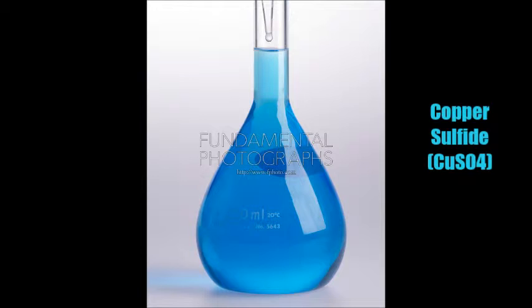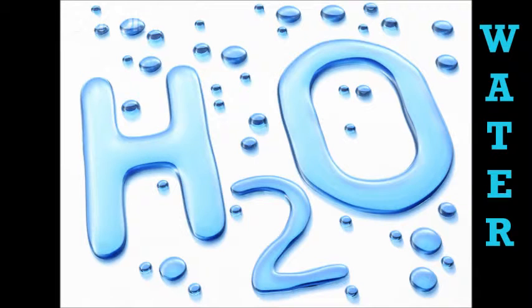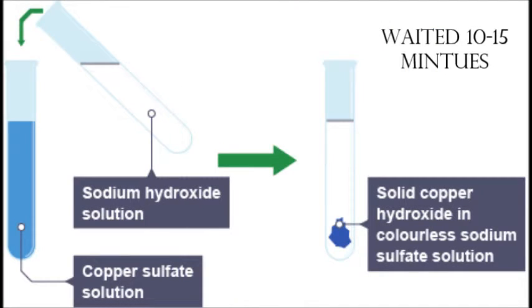We filled some of them up with water to keep all test tubes at 13 milliliters. We then stirred each mixed solution with a spatula and let them sit for 10 to 15 minutes while we waited for the precipitate to form.